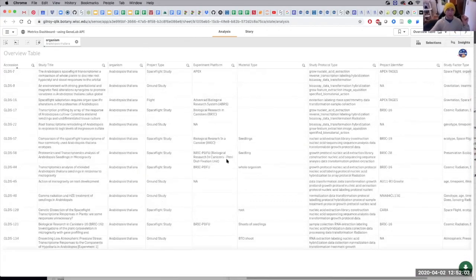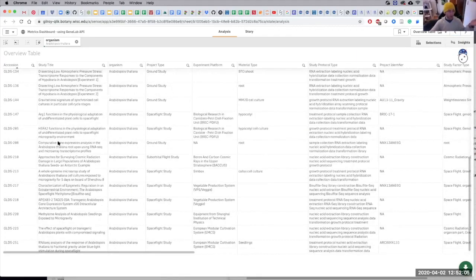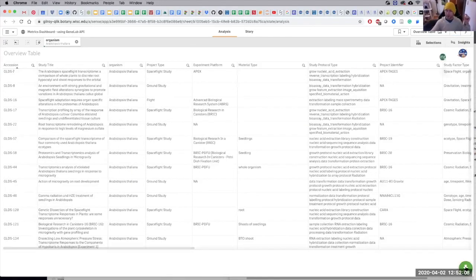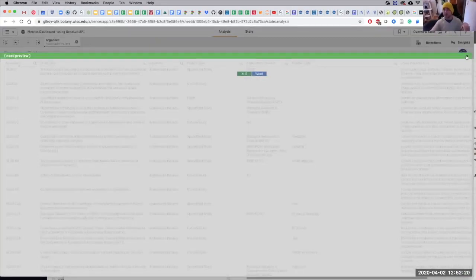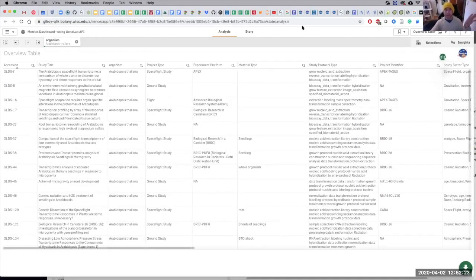Okay, if I now wanted to download this, I could just click on the green button here. Oops, click on that green button there. Where's it gone? Well, usually when you click on that green, there it is. It's just appeared there. You can then click on that, and I can just download this table. And then I could have my metadata. Usually I do that, and then I'll go into Excel.